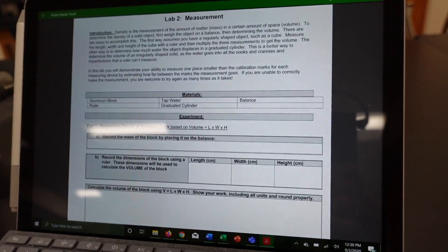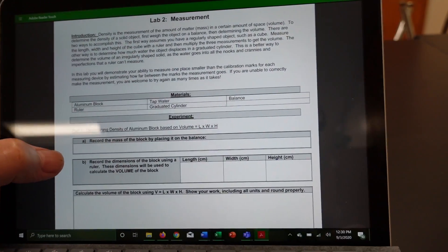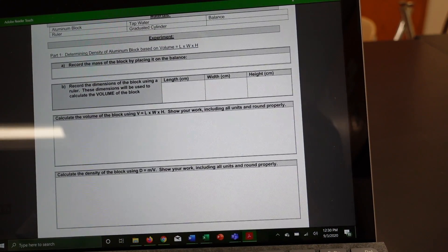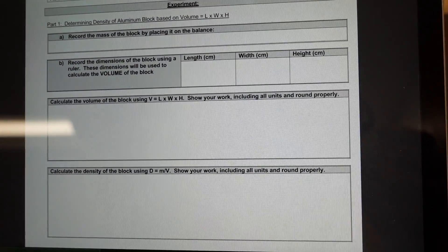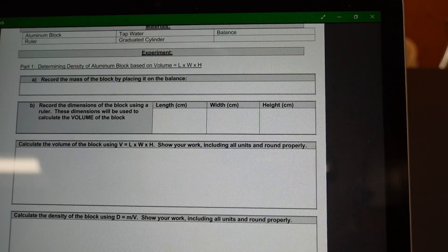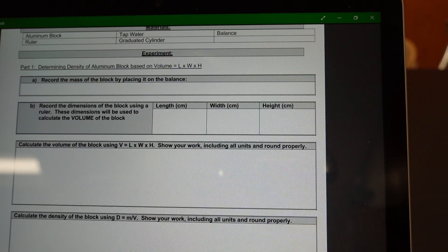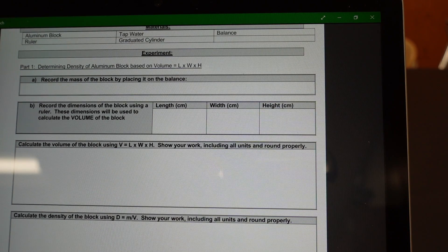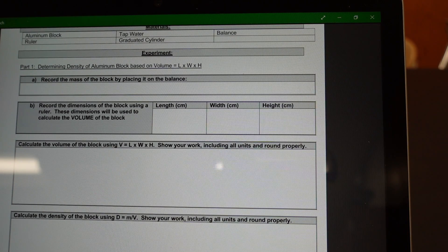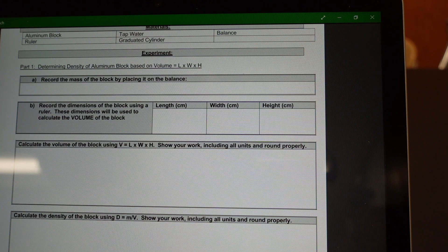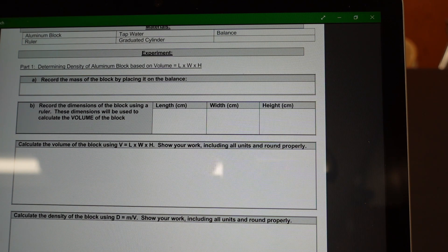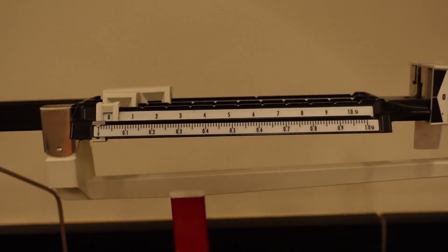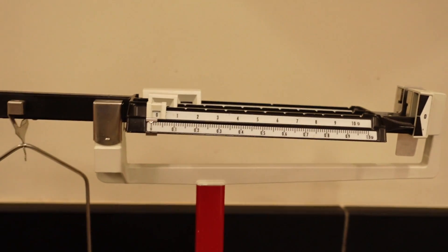So, what is the first item on the agenda, according to this lab? The very first thing we have to do is to record the mass of the aluminum block on the balance. See, we're going to find the density of aluminum. And we're going to find it in two ways. As you're aware, density is equal to mass divided by volume. So, we can measure its mass really easily. All we need to use is this little gadget right here.